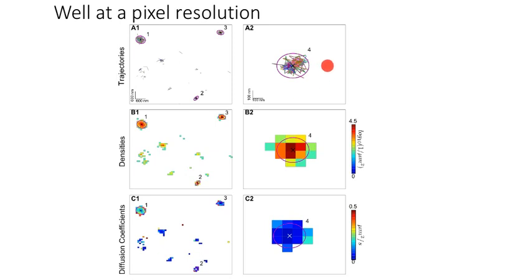If you look at the resolution of this compared to, for example, the resolution of the microscope, you realize that these trajectories that have been acquired at the super resolution are much better resolved compared, for example, to a confocal image. Yet we can estimate from this trajectory, and we have developed techniques in the past.